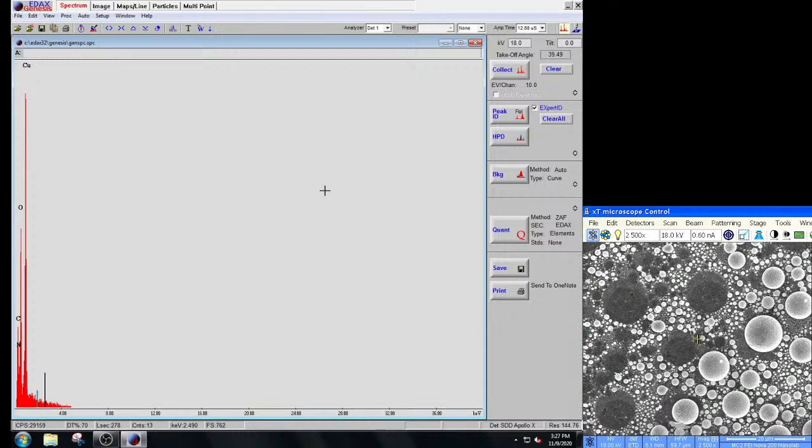All right, so in the user interface, Genesis has 5 tabs available on our software.